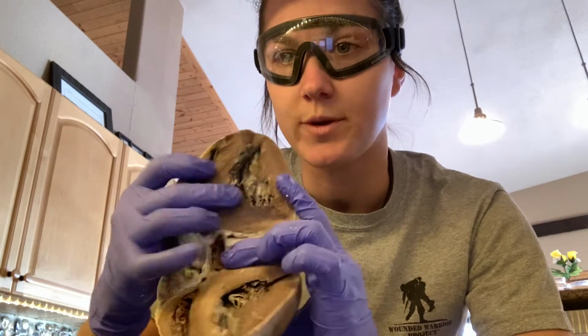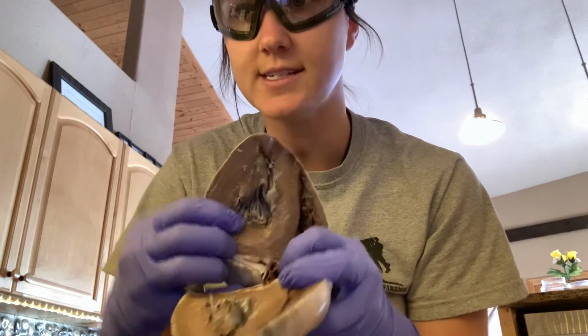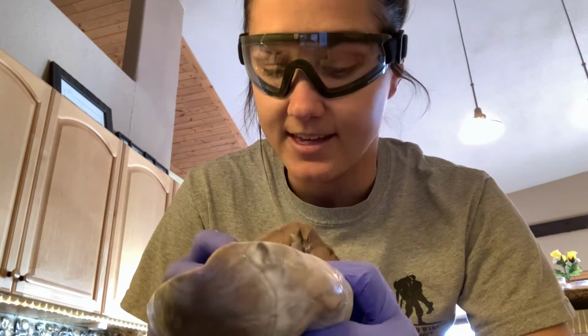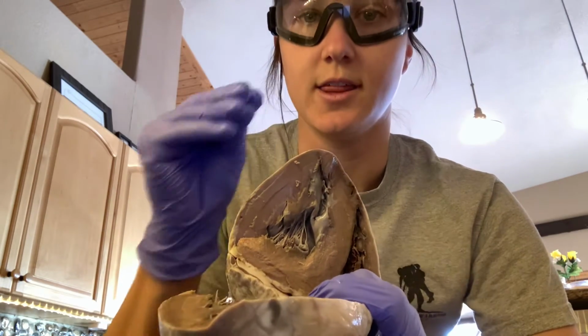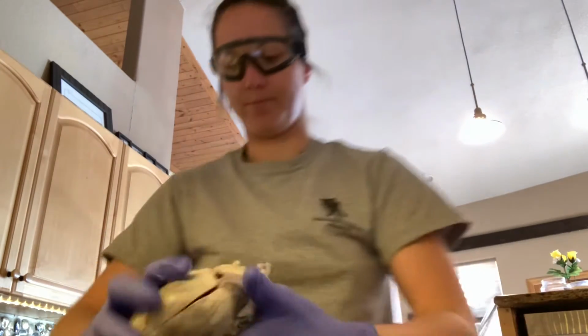And since I have this open here, let me just run through these little strings. These are called chordae tendineae, and these are actually called the heart strings, and these are what open and close the valves. Side tangent. Okay, let's go back.